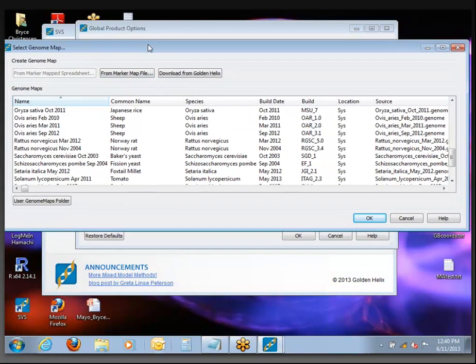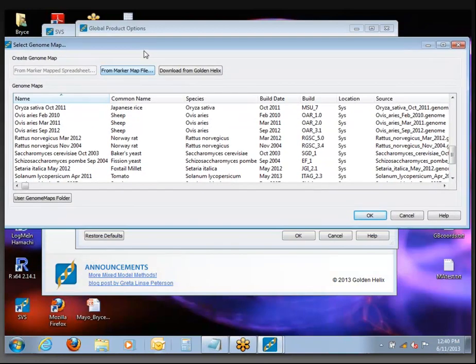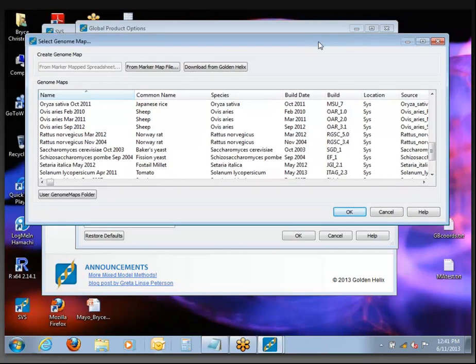The important part about the genome map selection is that it is what's used when you start drawing any plots in genomic space. It needs to know how many chromosomes there are, how long each chromosome is, and use that data to create your visualizations in the proper context. There's honestly not a lot else that the genome map is used for.